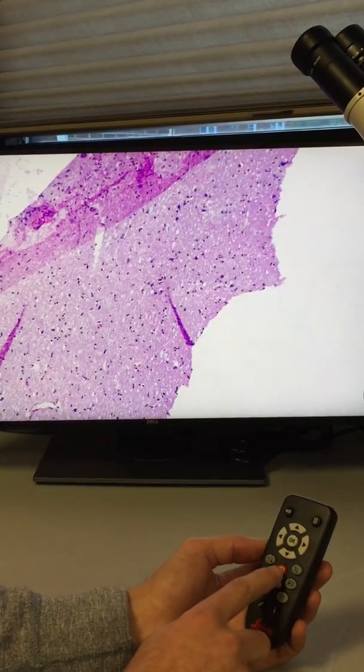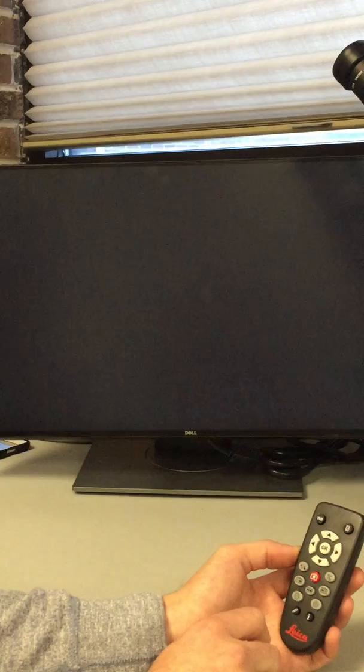And most importantly, by hitting this red button, you're able to capture an image to that SD card.